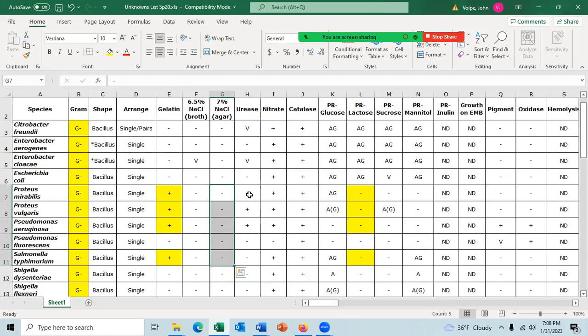You could do urease. You'll have three positive and one negative. You wouldn't want to do nitrate. You wouldn't want to do catalase. You probably wouldn't want to do PR glucose. You could do PR sucrose because then you can separate one from three.